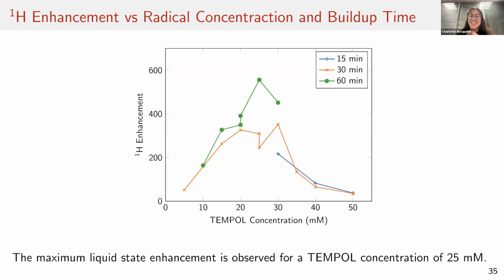Ta-da! So it works out to roughly 100 meters per second. Yeah, it's a bit slower if it goes around a bend, and it maybe is a bit faster if you increase the pressure. So we use 8 bars here to push the bullet, and then you get these speeds. And that translates to something a little less than 100 milliseconds to go from one magnet to the other. So you use helium pressure to drive the bullet? Yeah, you have to, because everything else would freeze, right? You have to push it out of the cold space of the magnet.